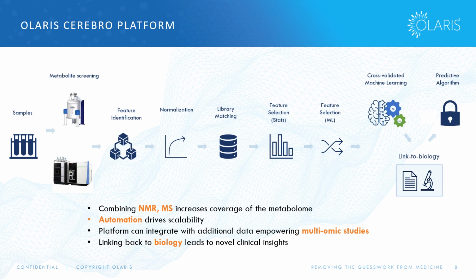So we use the CEREBRO platform, and I hope somebody gets the reference. We get our samples, we analyze them with both NMR and LCMS because we believe in the power of combining these platforms. We have our feature identification, all our data processing, and then a machine learning algorithm that can finally give us a predictive algorithm for a treatment or a disease. But we firmly believe in the link to biology, because everything that comes out of this machine learning has to make sense. If something doesn't make biological sense, it's useless for medicine.